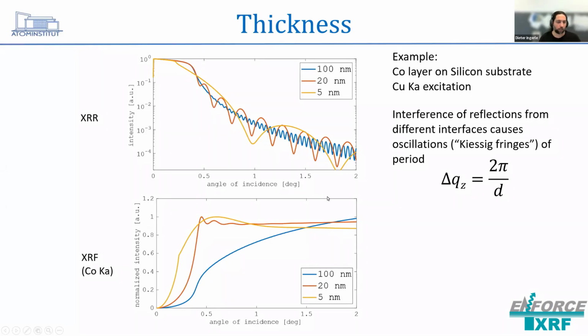Okay. Yeah, then the next part of information you can relatively easily extract. So depending, of course, if you have one layer, it's quite easy. If some multi-layer structure, it can be more difficult. But typically with the XRR, it's quite easy to see the thickness of the different layers. Basically, you could even do Fourier analysis about the maximum and minimum, so about the frequency of this intensity change, and calculate the different thicknesses in the sample.